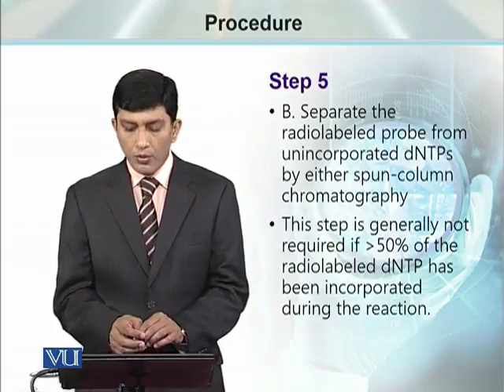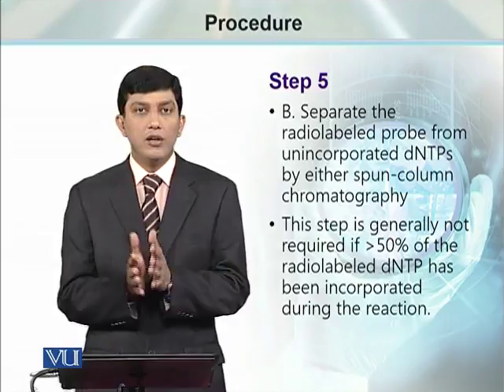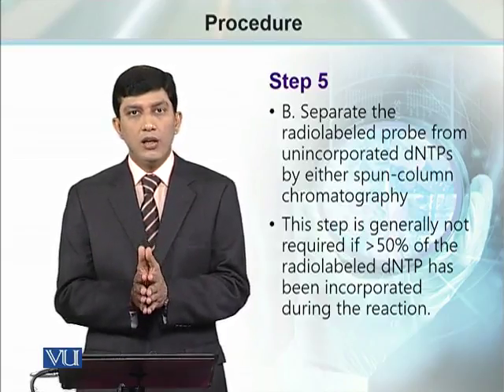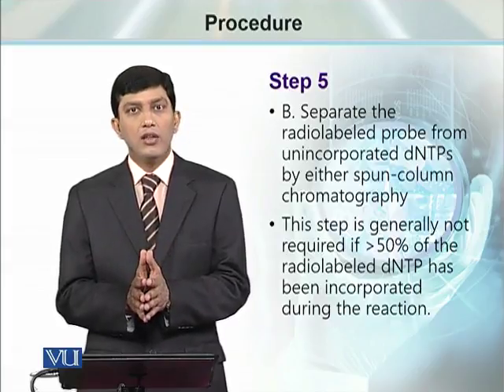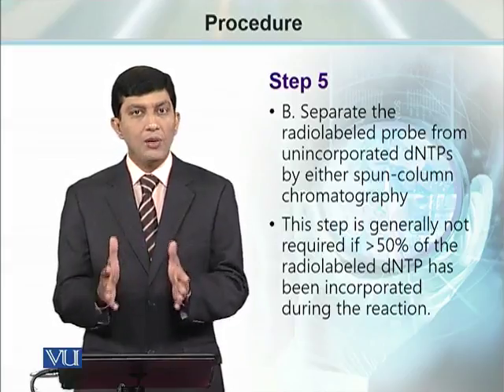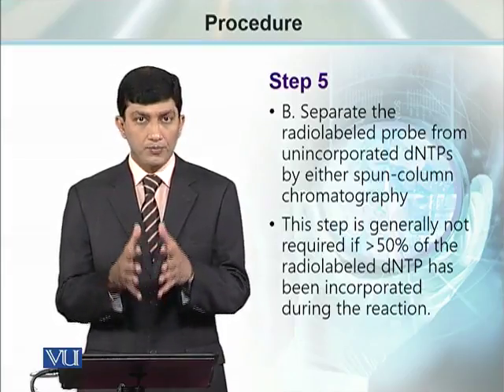In this step, more than 50% of the dNTP or the radio labeled nucleotide is incorporated. We can see that the probe will have very high specific activity. यहाँ पे एक चीज़ का जिक्र करना बहुत ज़रूरी है.